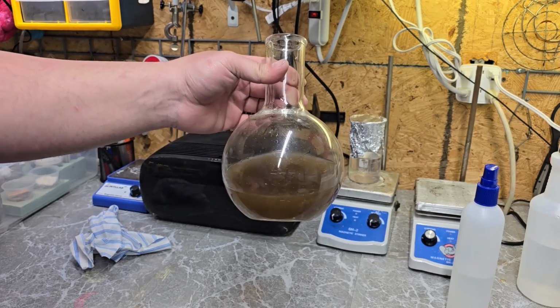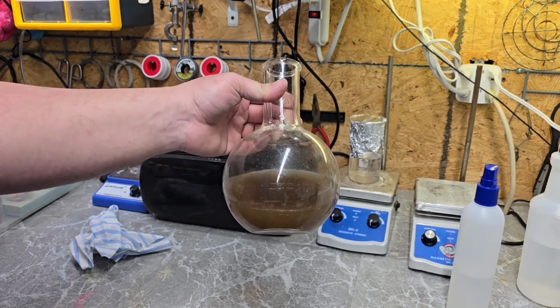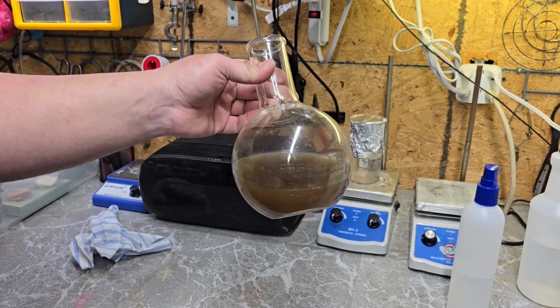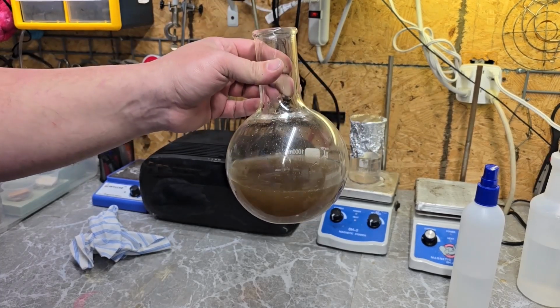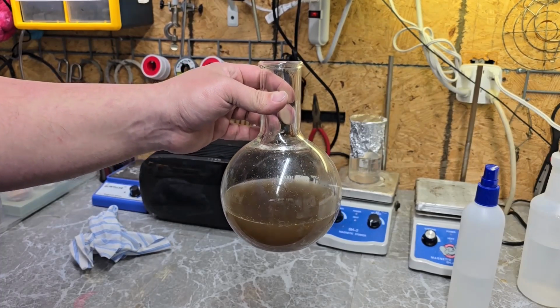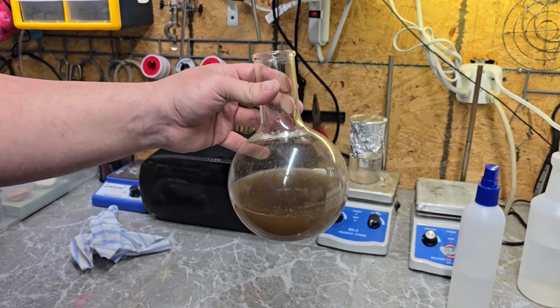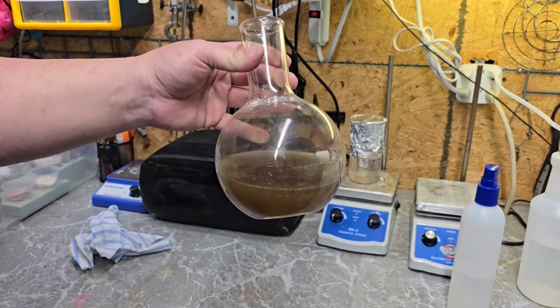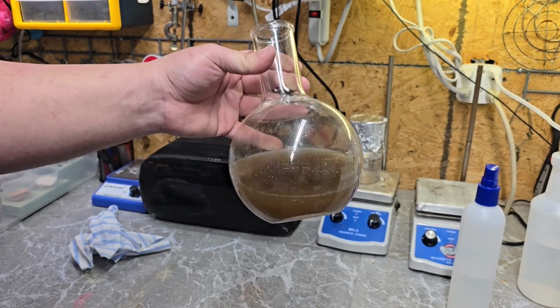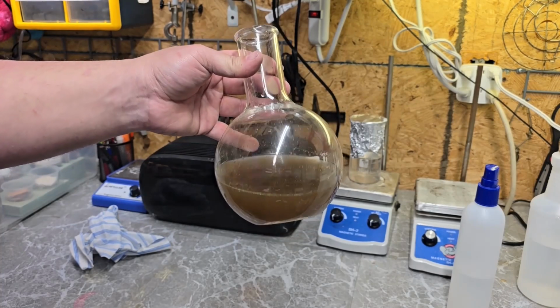Now that we have whatever we're going to get from that short washing and short shaking method, I want to take this solution and run it through a filter, so that I can hopefully concentrate some of the stuff that's in here, capture that onto some filter paper, and then use the stuff that's captured on the filter paper to make a further concentrated solution. I'm not going to do all of this. I'm only going to do about half of this.